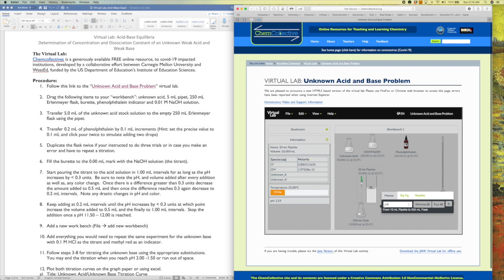Notice also that the units of this default to ml. So this is only in units of ml. And so now I put in my volume and I'm going to pour that volume into my empty flask, and you can see now that my pipette is empty and its contents have been transferred to the 250 milliliter flask.